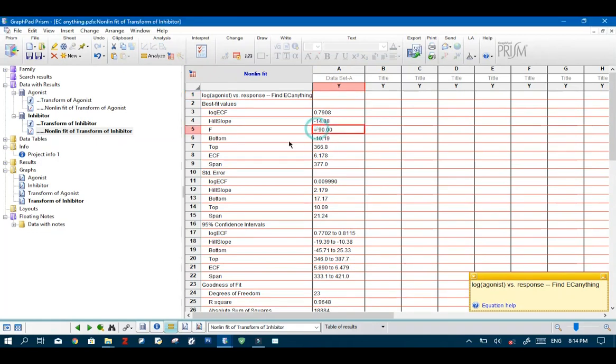Now when we enter 90 the result we are going to get is the actual IC 10 like I explained before.